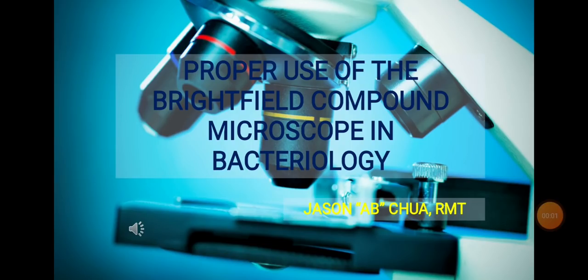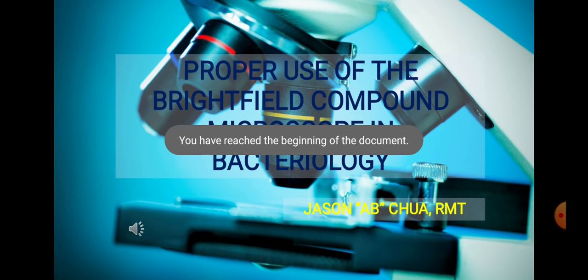Everyone, welcome to learning activity number one, which is entitled The Proper Use of the Brightfield Compound Microscope in Bacteriology. And I will be giving you a prelim discussion about it.